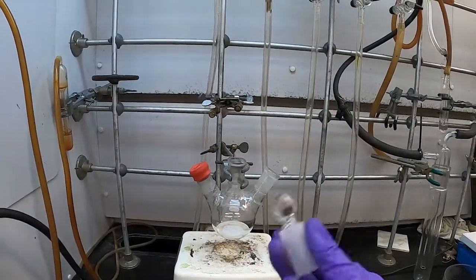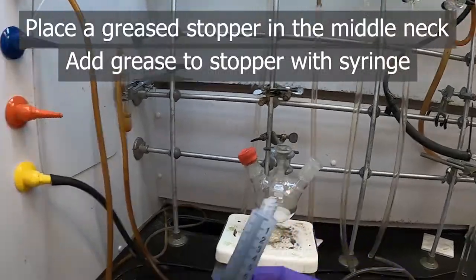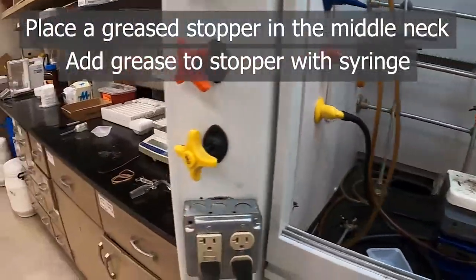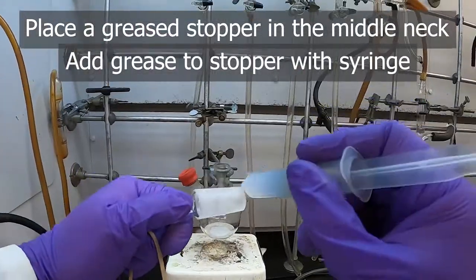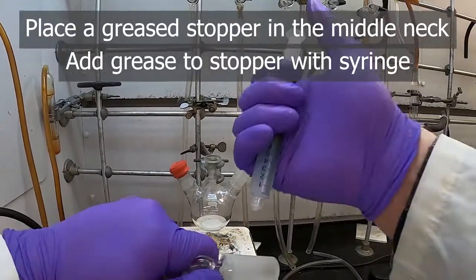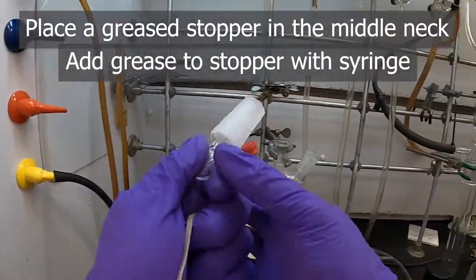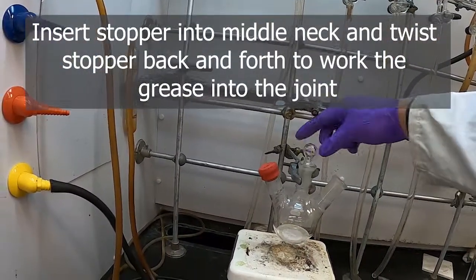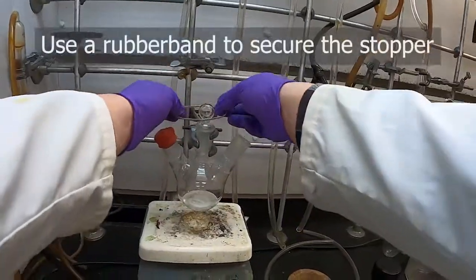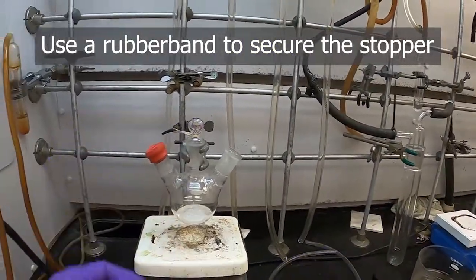The middle portion there will receive this stopper, but we need to grease it first so that it seals well. So you'll see a syringe sometimes loaded with grease. If you don't have one, you'll want to use this Dow Corning high vacuum grease. That's what's in this syringe. To grease the joint, all we have to do is really gently push on the syringe and put a sort of thin streak. I like to do 3, in a triangle pattern. Just a real thin streak there. Insert and then twist carefully your stopper to get it sealed, and then we're going to use this rubber band to hold that down.